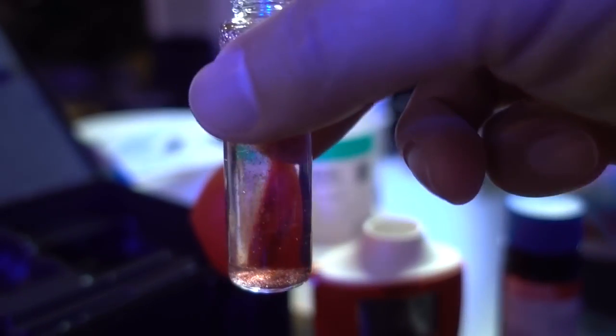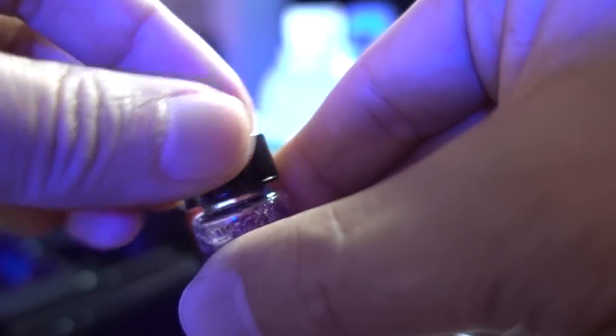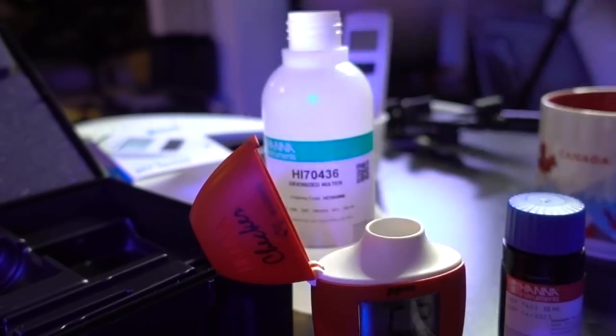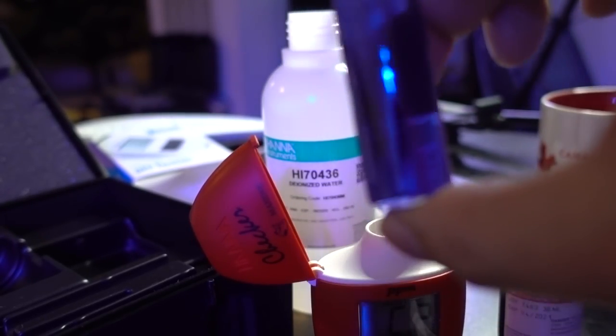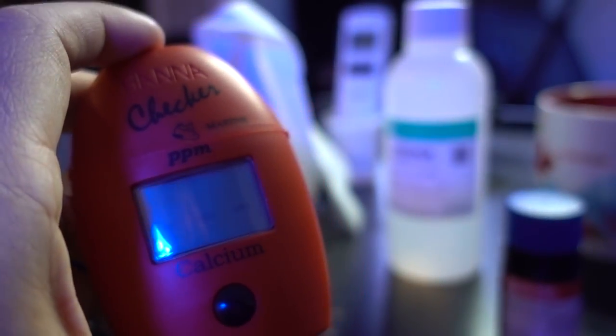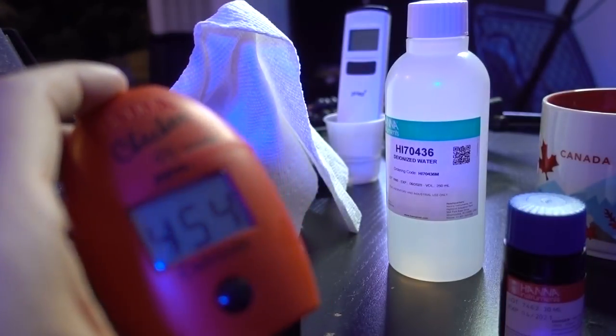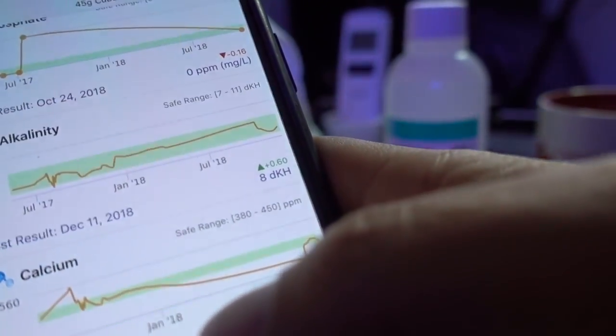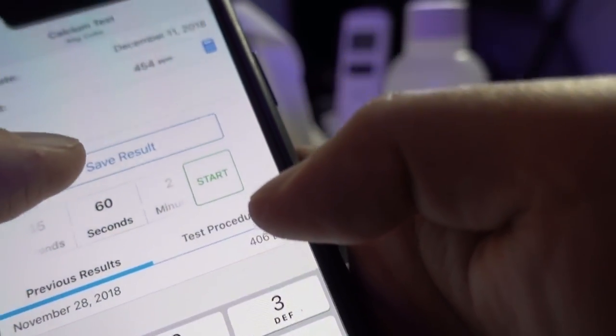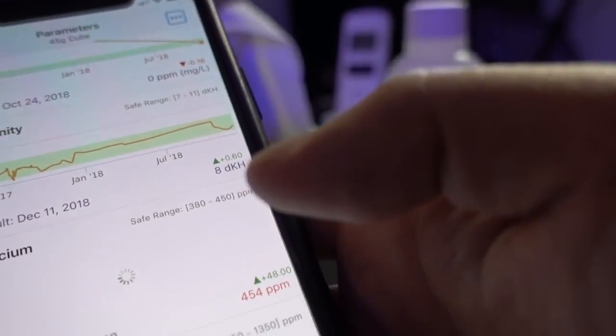I was talking to Kevin at MACNA saying why don't they make it like those instant coffee tube shapes, right? But they say that this kind of packaging is used for a lot of scientific reagent, so it just makes a little bit more sense to produce it like this. If I follow instruction on how to cut it, it's actually not that bad. It's pretty easy to pour in. You make a little funnel up front like this and perfect. Now I just dump everything in here. I feel like a mad scientist every time I do this. And we'll shake vigorously for 15 seconds to make sure everything dissolves. Let's shake it like a Polaroid picture. And then we're going to wait 10 to 15 seconds to make sure all the bubbles escape so it does not affect the reading. My target is about 440. Let's see what calcium is at. 454. Not bad at all.